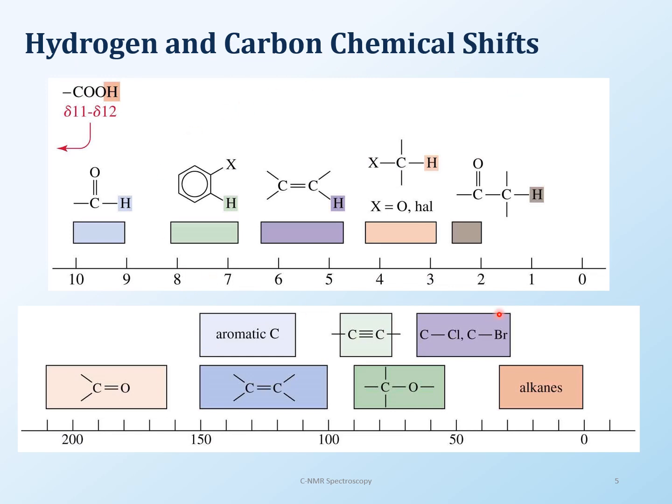So now for the chemical shifts. We talked about the number of signals. The chemical shift is very similar to proton. If you remember, we talked about the alkanes. This is the proton one on the top. Alkanes come over here, and aromatics are here, and then carbonyls are here. Remember, there is no separate acid region because that's carbonyl. So that's going to be around 200.